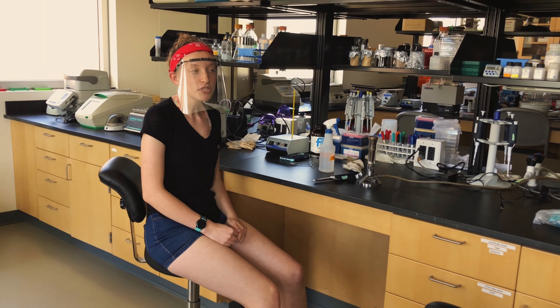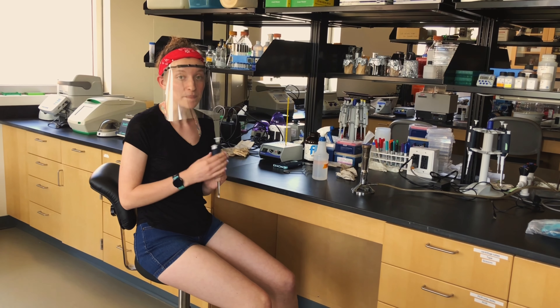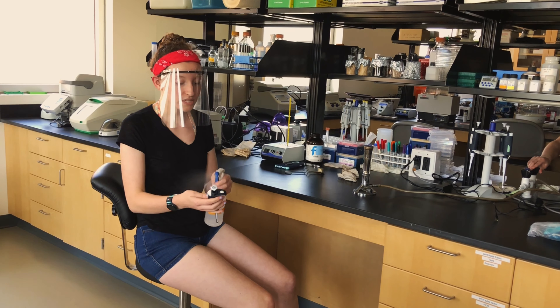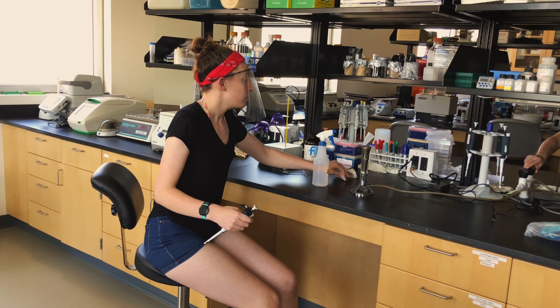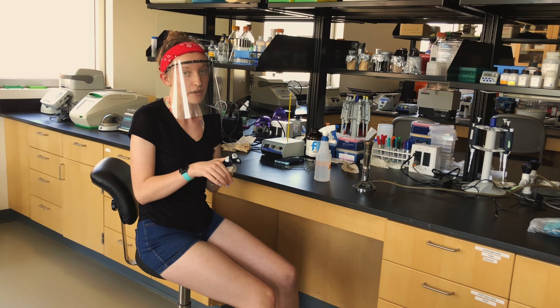Remember that after you are done working, all of your materials must be put away. Any common materials, such as pipettes, need to be sprayed down with 70% ethanol. Make sure that you wipe them down with a paper towel and then put them back where you found them.